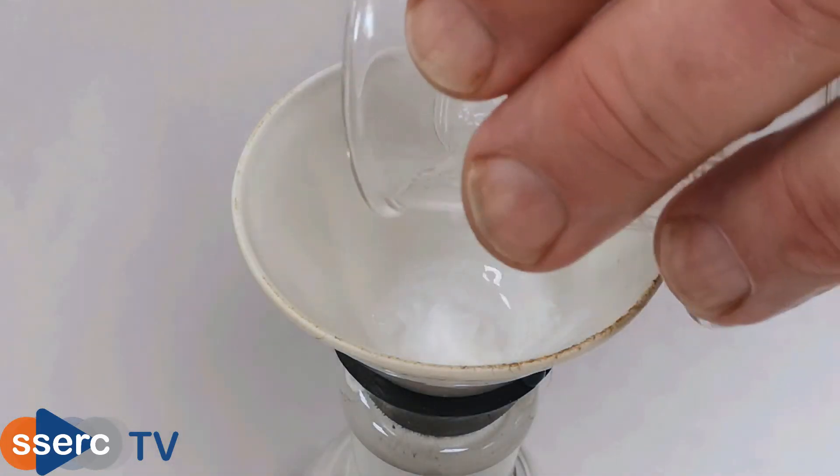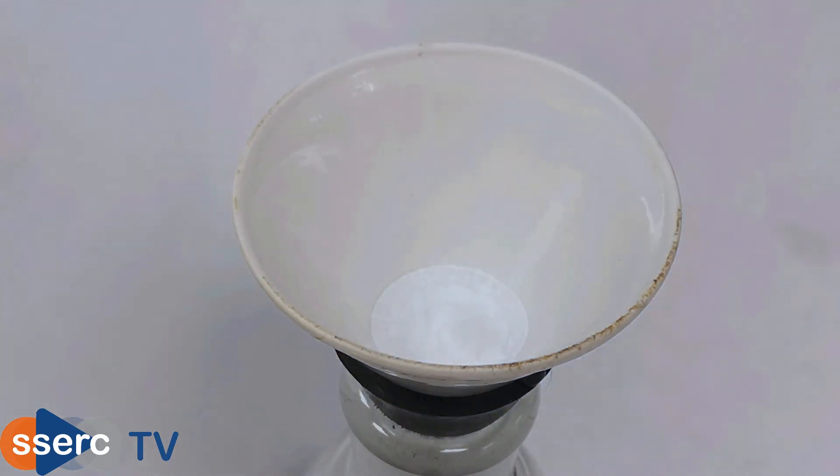We wash out the beaker with a few cubic centimeters of chilled ethanol and then leave it on the filter paper for a minute or so to remove all traces of the solvent.